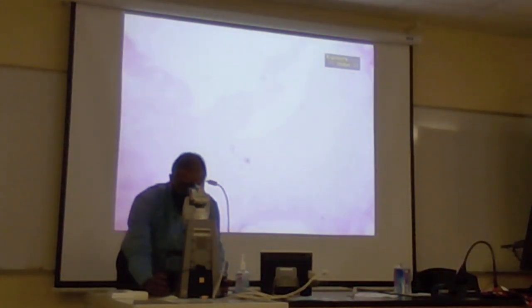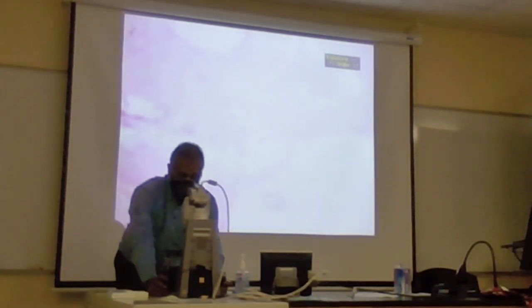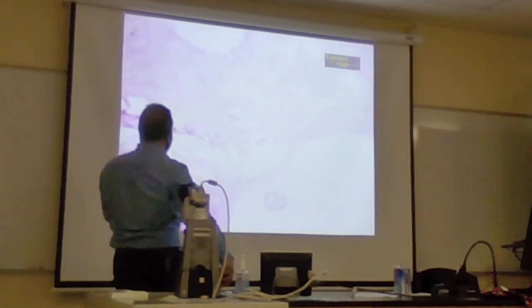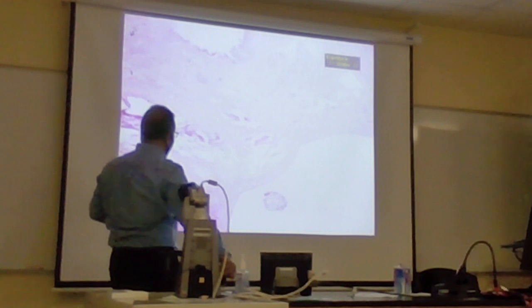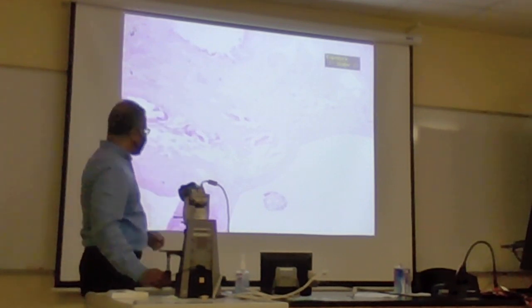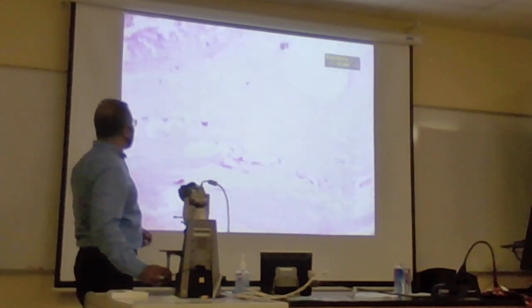Okay. Do any of these look familiar? Yeah, there is a mismatch between what you see through this and focusing on this. It's really annoying.